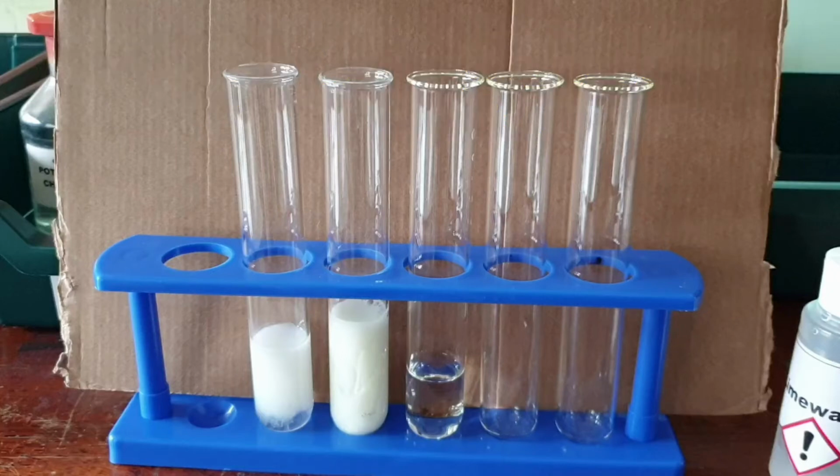Okay, so this is Mr. Tinkler from the future. My video messed up, stopped recording, and I didn't notice. So here's me adding in over the still edit, to show you what you forgot. The first compound has a chloride compound in it. The second one is potassium chloride. The second one has potassium bromide, and the third one has potassium iodide. And what you've missed out on is I have added silver nitrate and nitric acid to them.